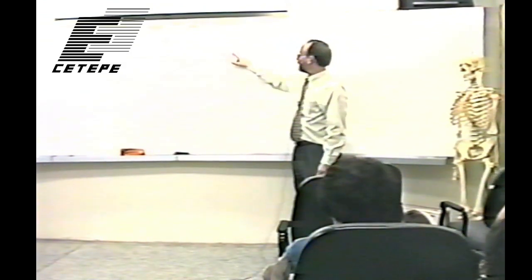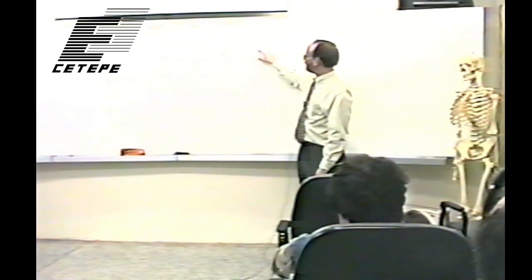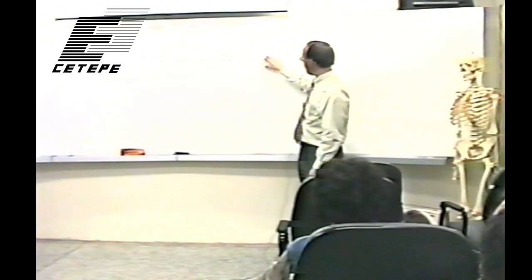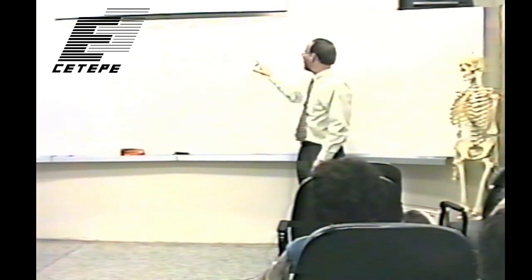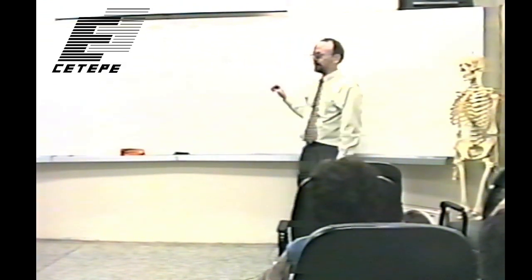So I'm not good enough to draw the ray paths in here, but the point is that these rays coming out of here are parallel, focused to infinity, which is the reason for having this lens. Because then the requirements on the objective lens of your CCD camera or other video camera are not so stringent. Because this is focused at infinity, it's much easier to focus the camera and capture that light.